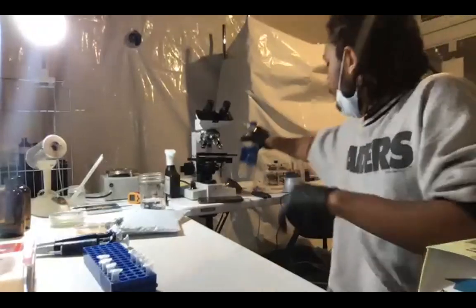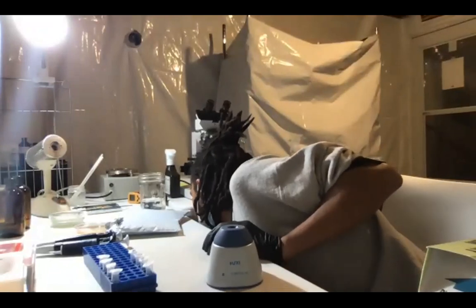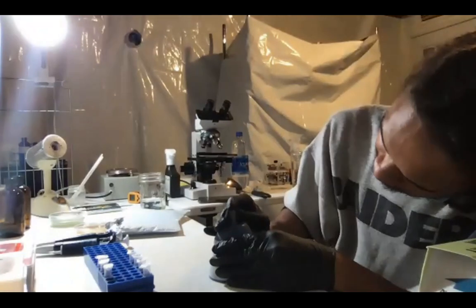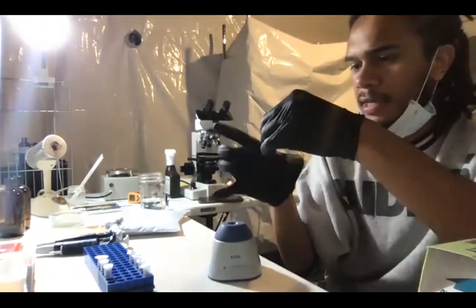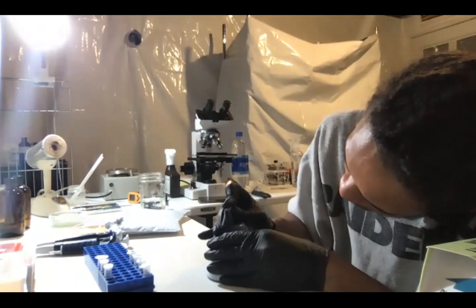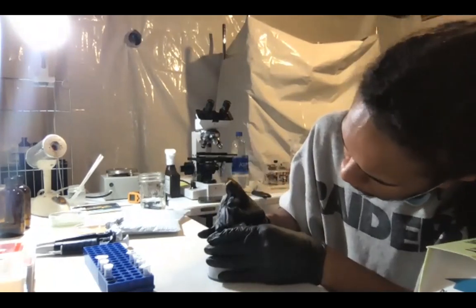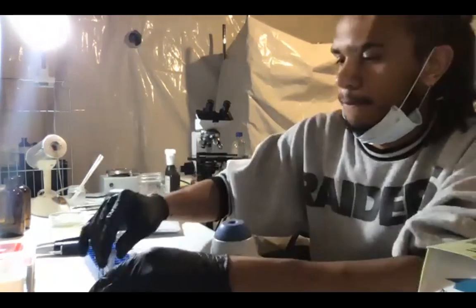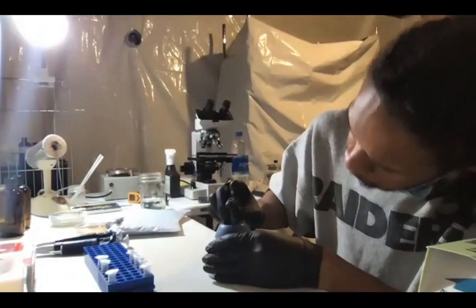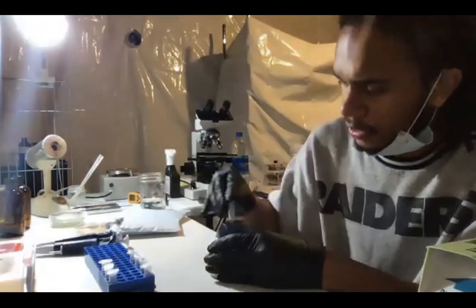I'm going to grab my vortexer to mix them all up. This will get all the drops off the side. Click it a couple times if you need to, and then do it again. Kind of twist it around. Make sure everything gets mixed up. You want to make sure it's in solution. If a drop of the primer is still on the side, that can really mess everything up.